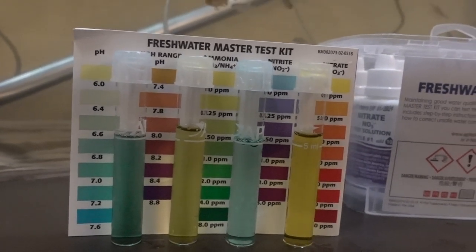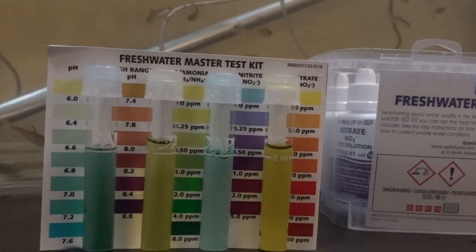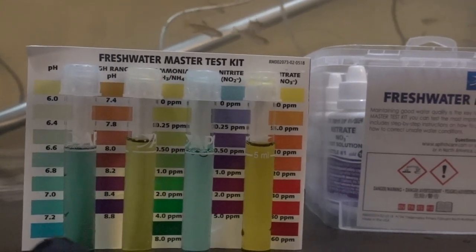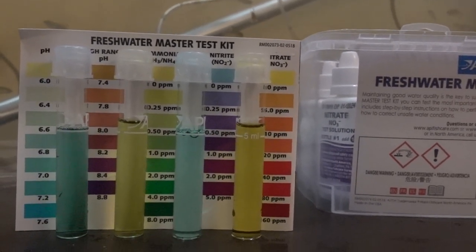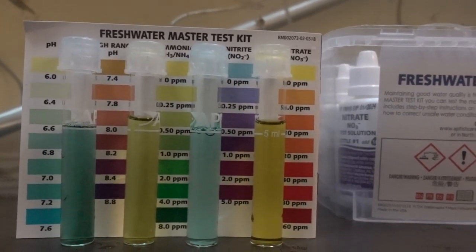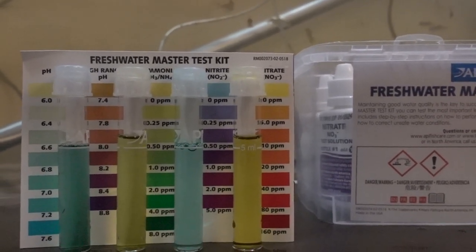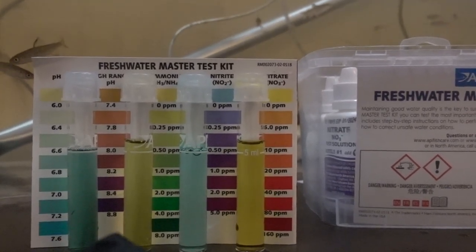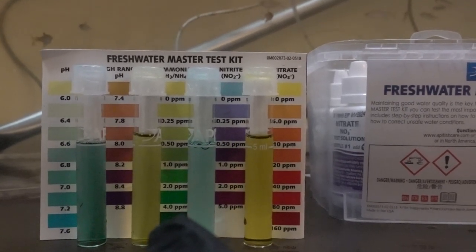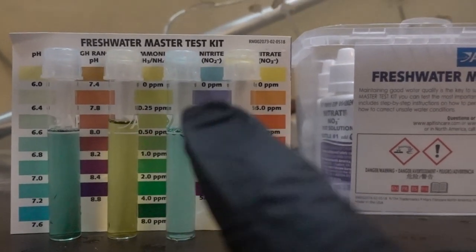On the far left we've got our pH, indicating the pH of our water on a scale of 0 to 14, with 7 being neutral — how acidic or basic our water is. It might be hard to tell the color from this, but we're looking right around 7.0, right around neutral, which is good and a healthy place to be for our freshwater salmon.